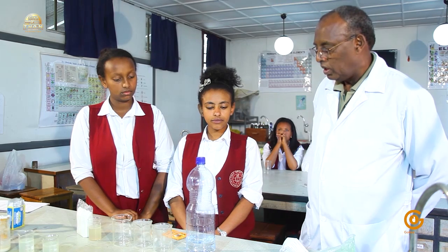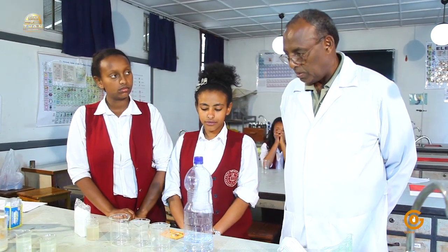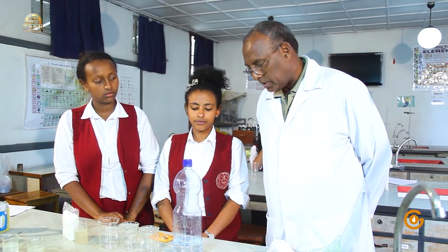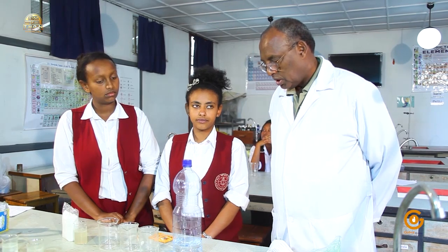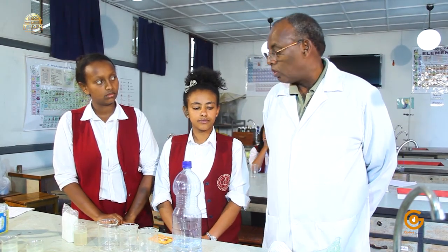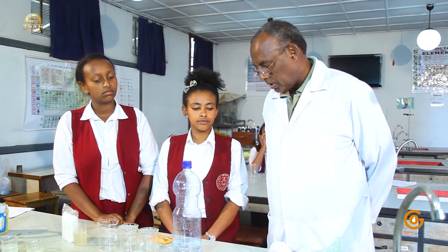Close to concluding today's subject, solubility. And now the last part will be comparing different substances in their solubility in one solvent, in this case the universal solvent, water.